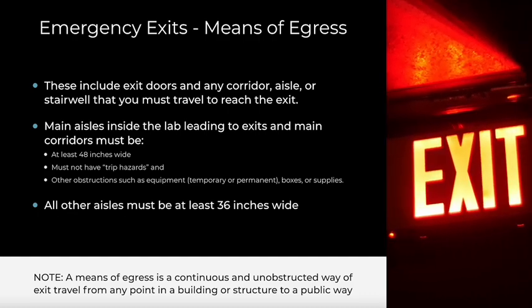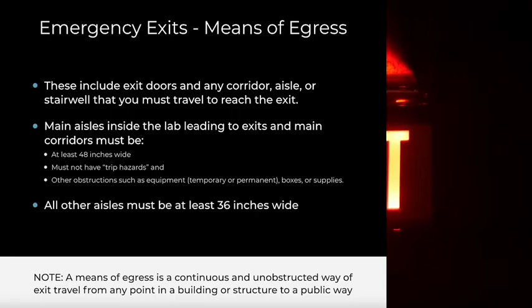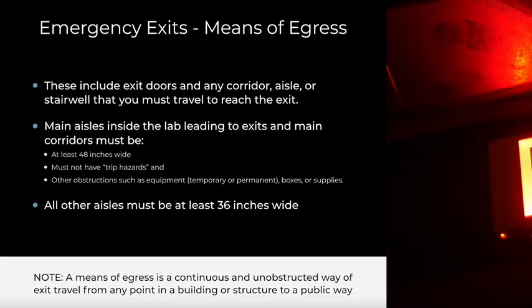It is important to note that a means of egress is a continuous and unobstructed way of exit travel from any point in a building or structure to a public way.